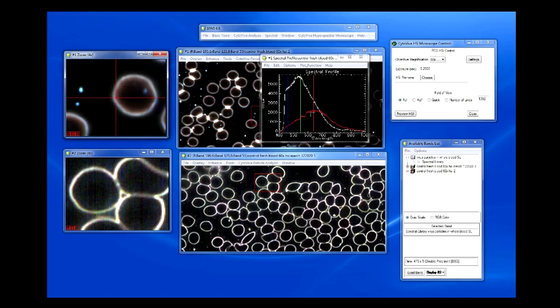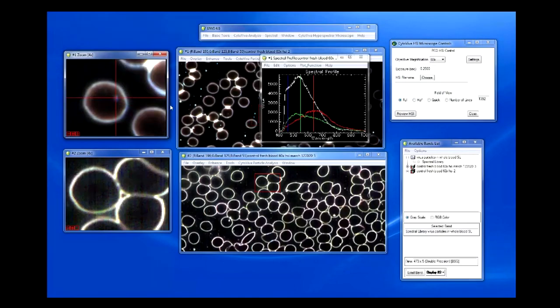Collecting the spectrum of a red blood cell membrane shows a dramatically different spectrum because the hemoglobin and other chemistry in the red blood cell has really different optical spectral characteristics versus the virus particle. In this field of view we actually have a virus particle interacting with the red blood cell as well, and clicking on it shows three different spectral profiles: the virus particle in plasma, the red blood cell by itself, and a hybrid spectrum from the virus particle interacting with the red blood cell.